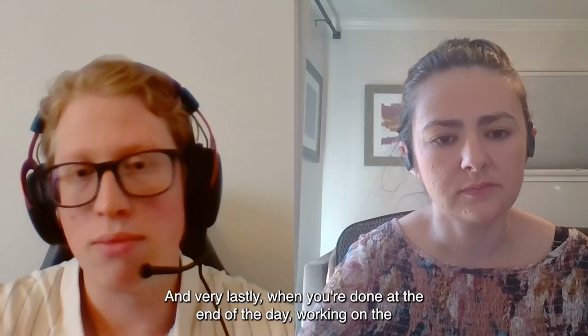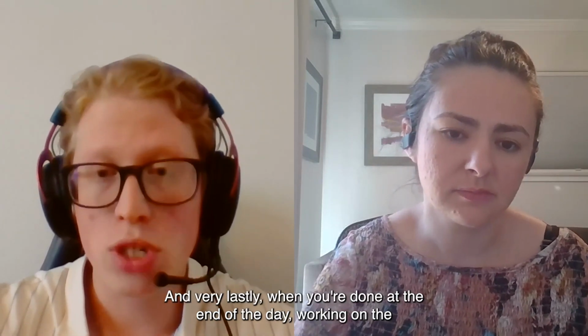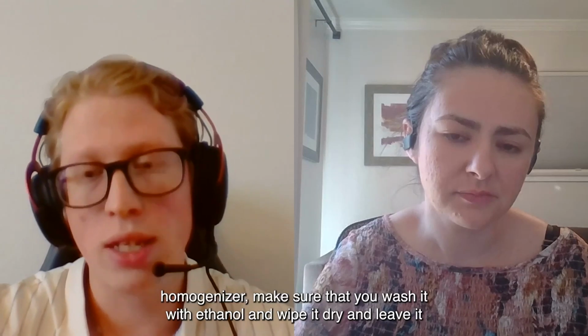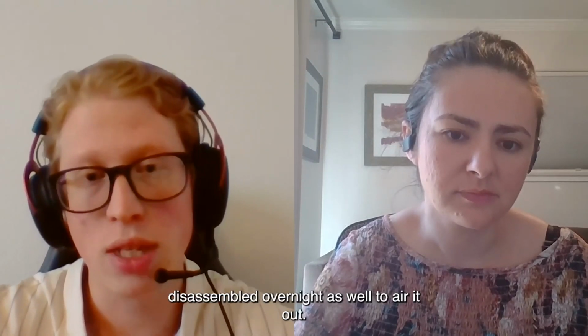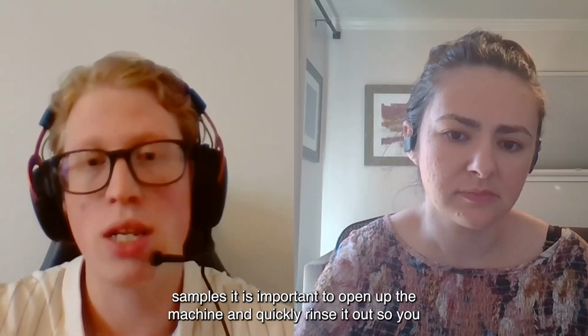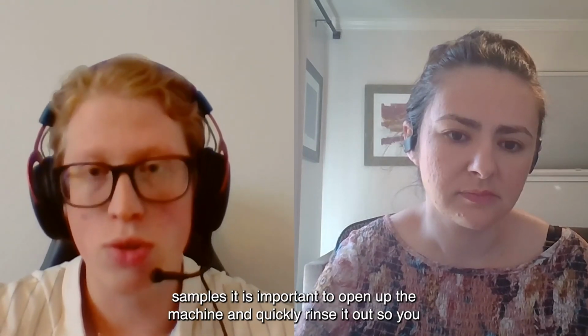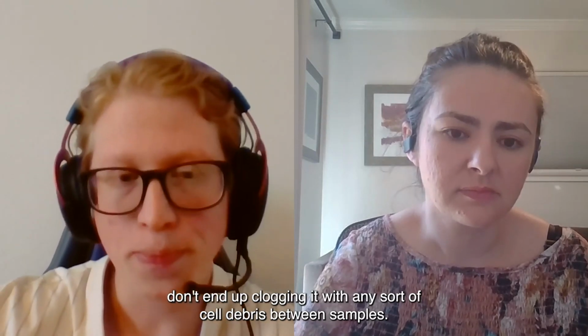And very lastly, when you're done at the end of the day working on the homogenizer, make sure that you wash it with ethanol and wipe it dry and leave it disassembled overnight as well to air it out. And even between samples, it is important to open up the machine and quickly rinse it out so you don't end up clogging it with any sort of cell debris between samples.